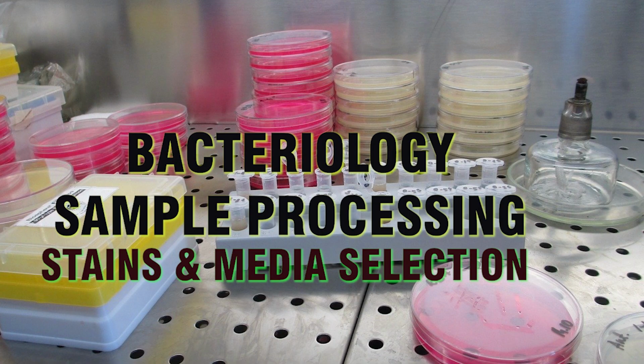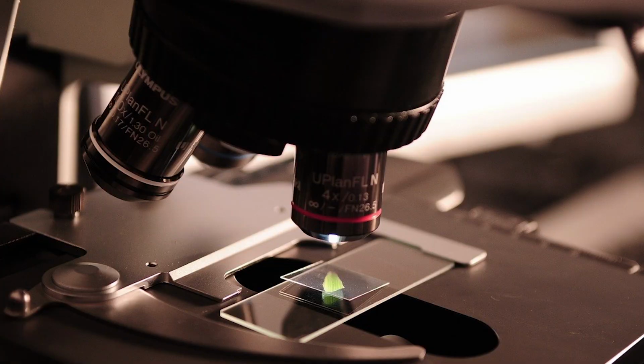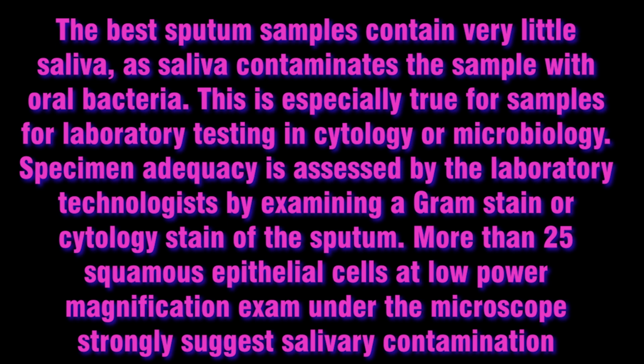In this video, we will discuss bacteriology, sample processing, direct smear for staining, and selection of culture media. All appropriate microbiology samples should have a direct microscopic examination. The direct examination serves several purposes. First, the quality of the sample can be assessed.